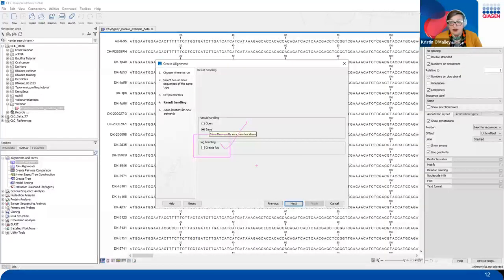So this is really, really helpful if you have, say, a public health lab or a clinical laboratory where you need to make sure to generate all sorts of documentation behind what you did with all of these samples and what they traveled through. So feel free to select this little checkbox if you wanted to create a log alongside generating your results.